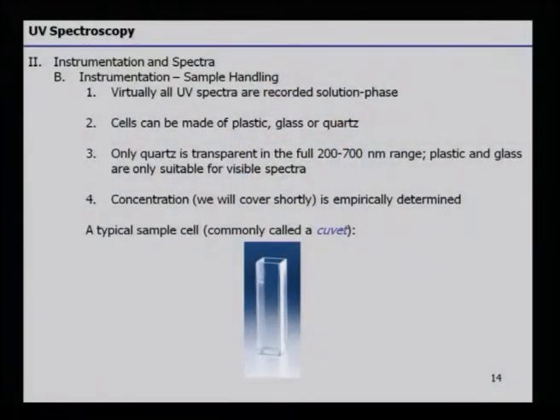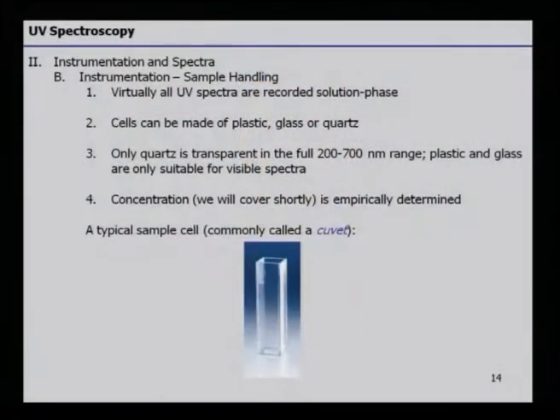Concentration, we can cover shortly, as an empirical determination by finding out what the initial concentration and the final concentration are, because the absorption of the material is related only to the concentration of the analyte. A typical sample cell or cuvette looks like this.